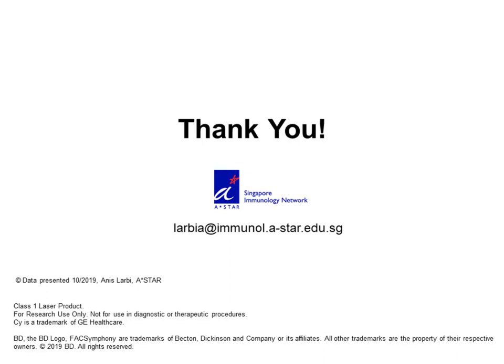At this stage, when you have the cheat sheet in terms of the density of the marker and which fluorochrome you can combine, it's not really important anymore which fluorochrome you have used, because the data in theory should be quite robust, based on the assessment we have done and some of the dropping data I showed you in some of the slides.